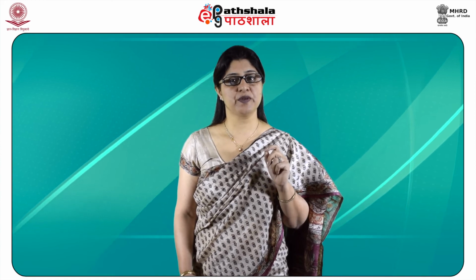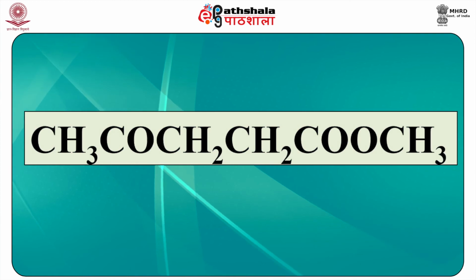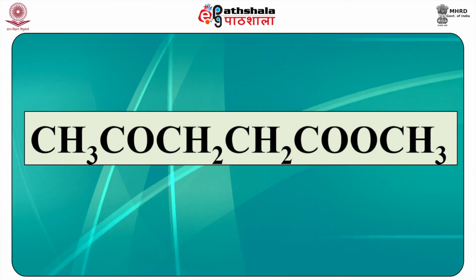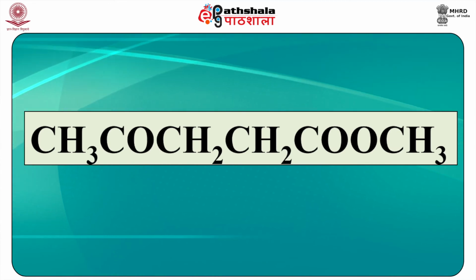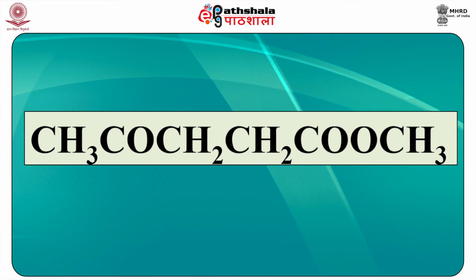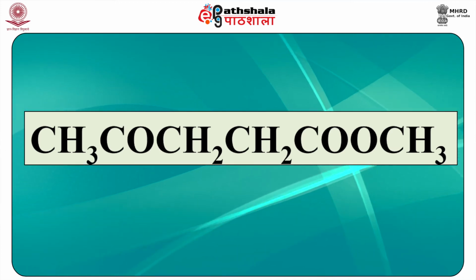Further, the presence of peaks at 170 ppm and 200 ppm indicates the presence of carbonyl functions. So, looking into all these above parameters, we can conclude the correct structure for the compound to be CH3, CO, CH2, CH2, C double bond O, O, CH3.